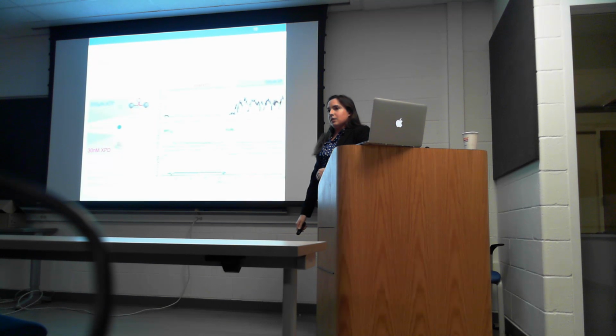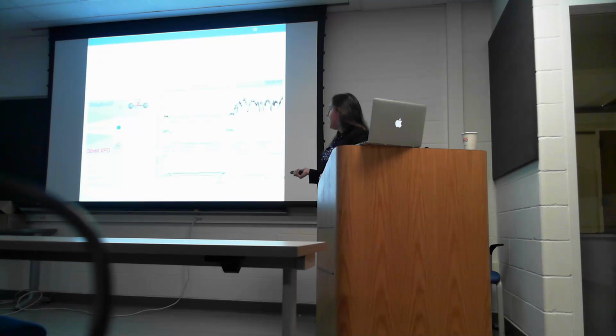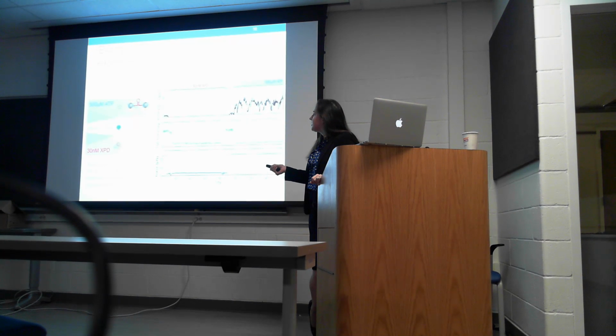And the force, you also load instantaneously? Yes. It's a force feedback mechanism. This is the actual force, 12 piconewtons. I turn off force feedback and it's low, and when I turn it on again, it's instantly 12, more or less. And increasing the force I do in the center, so by the time it enters ATP, it's at constant force and ready to go.